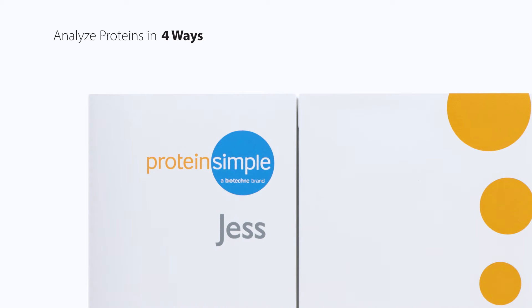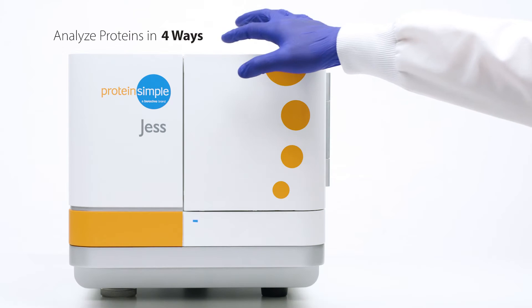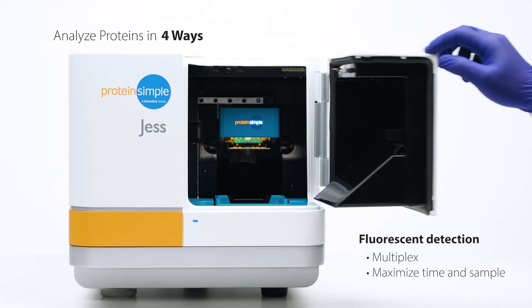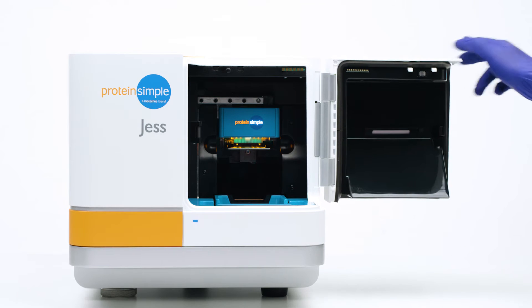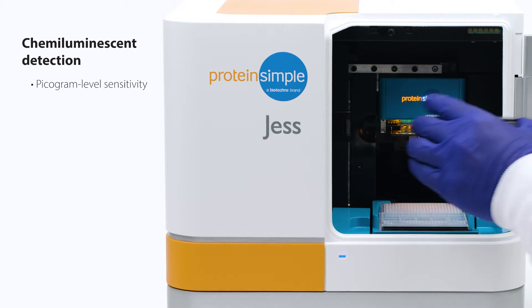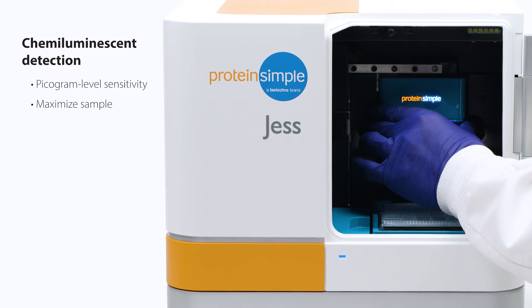Jess gives you four ways to analyze proteins. Her fluorescent detection enables multiplexing, letting you maximize your time and sample. With Jess's chemiluminescent detection, you'll get picogram-level sensitivity, letting you maximize the data you get from your sample.